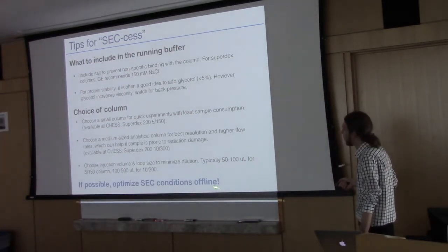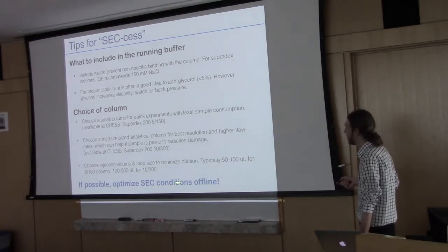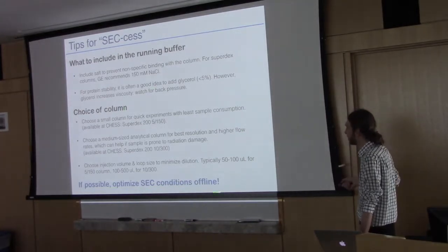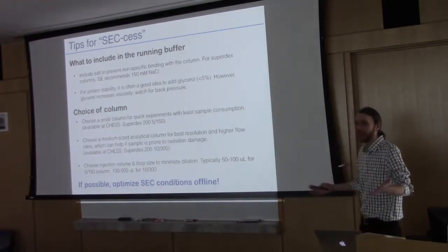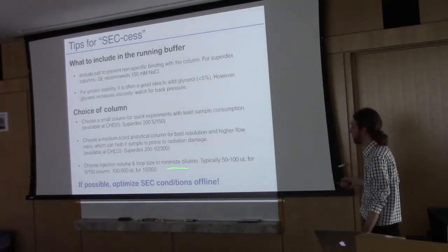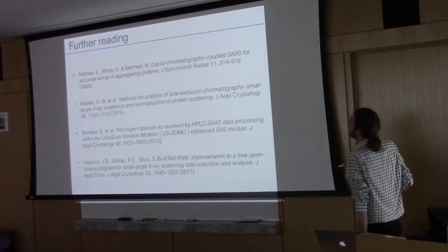Okay. And if possible, you should figure all this stuff out in your home labs before you come to CHESS. Since most labs have an SEC, this is pretty easy to do.